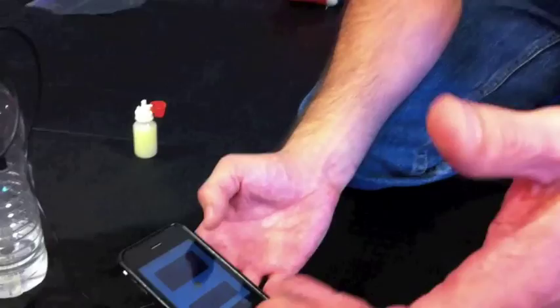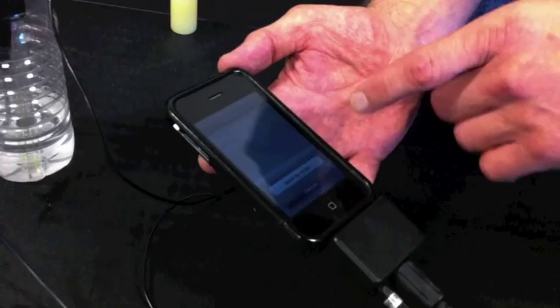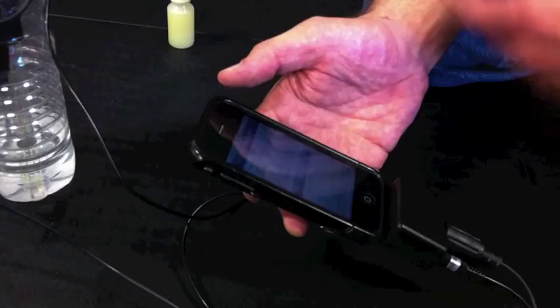When they're using the ODM PH meter app, they can take the readings and just send them all by email — it arrives at the destination with all the readings as a CSV file, so they can be directly imported into whatever desktop application. You can run all your analytics on them.